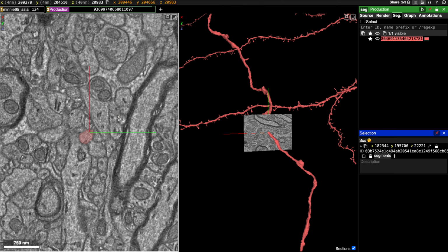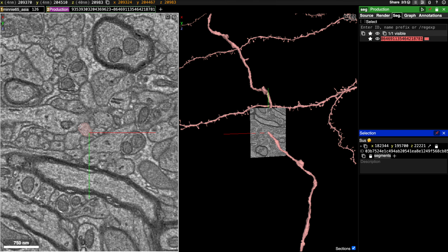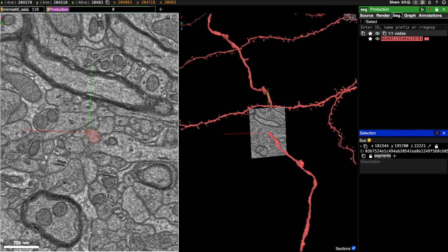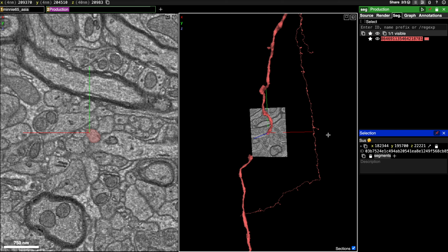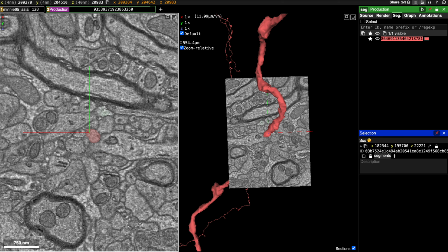So if I'm like this, then they'll go like that. If I'm over here, they'll go in this direction, etc. So the one caveat to this, let's bring it back so it matches pretty closely, is that if I have this flipped in this direction, there's not really a good way to match these up.